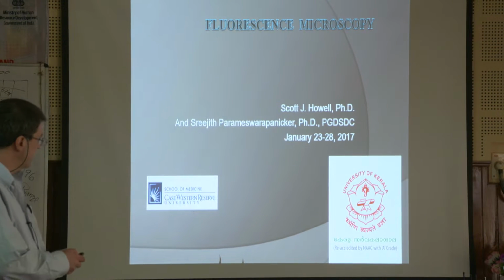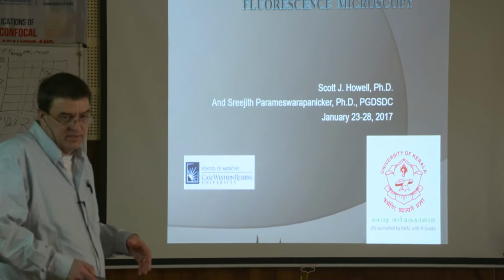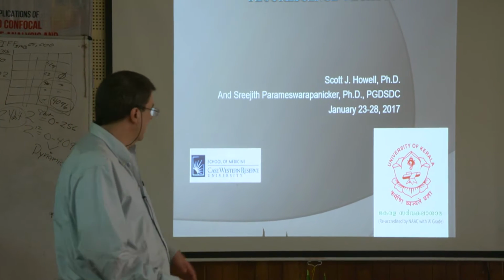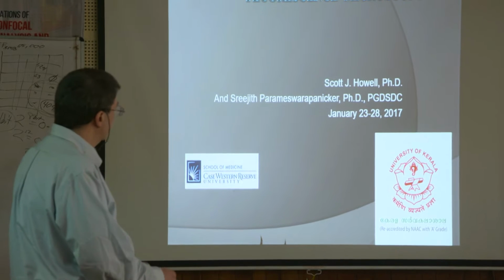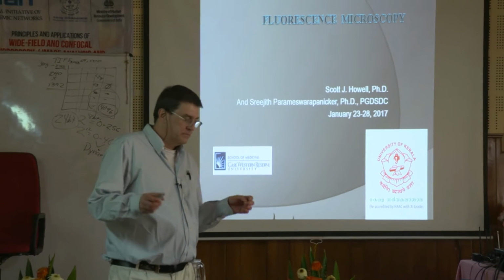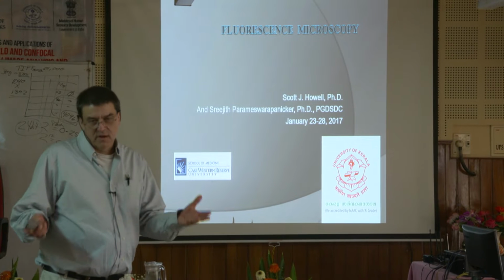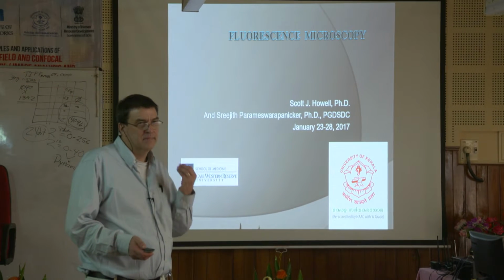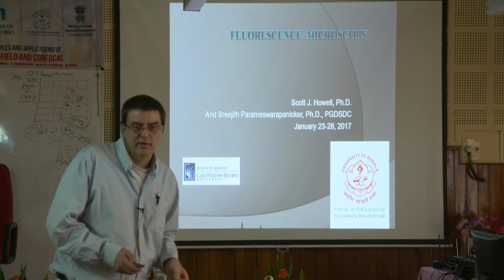But anyway, fluorescent microscopy, again, this is sort of the gist of what we've been driving towards. It's probably the main thing we're going to end up talking about, and which we'll be using the most. And all the other talks you've seen so far by the other speakers have all obviously involved fluorescence microscopy of one form or another. It's the pinnacle of optical microscopy, okay?